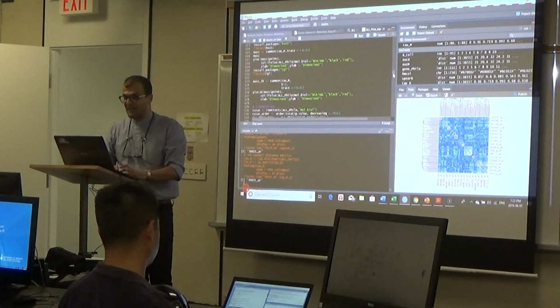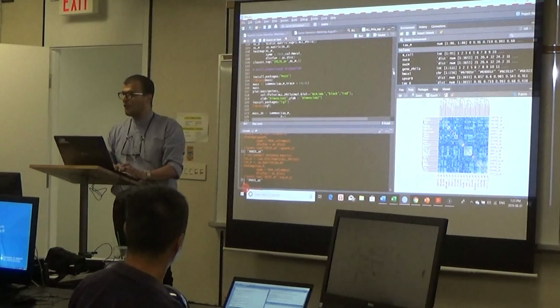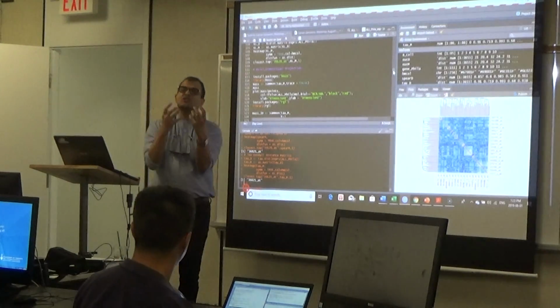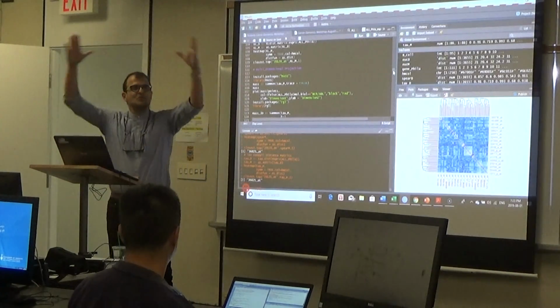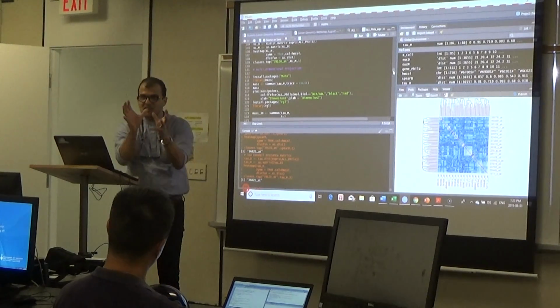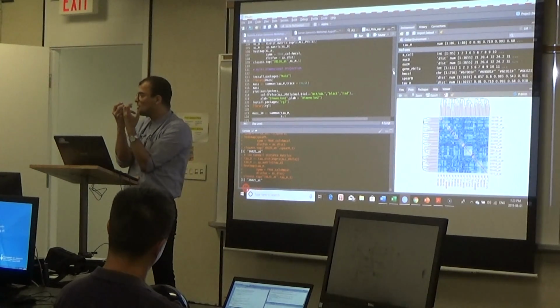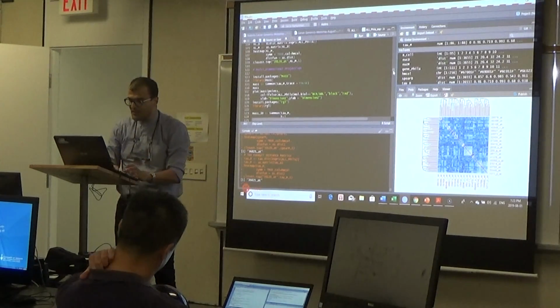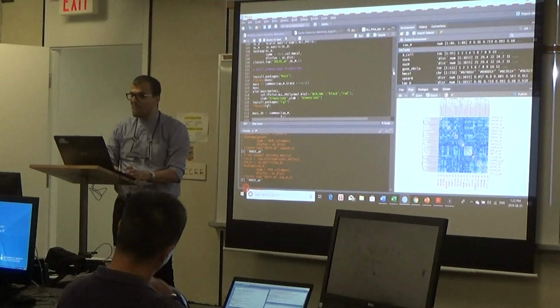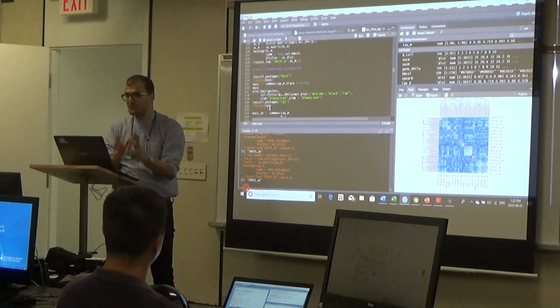We also have a projection technique, which shows your genes from that huge dimension into 3 dimensions. You can use your cursor to move around to see how genes are closely related to each other. Simply when you get home, just run them. The packages for that are MASS and RGL. Run those codes.